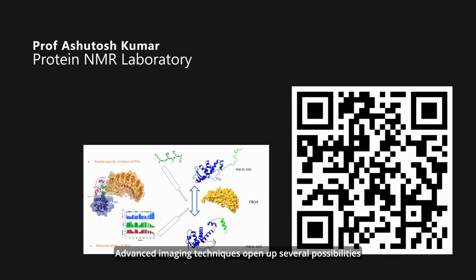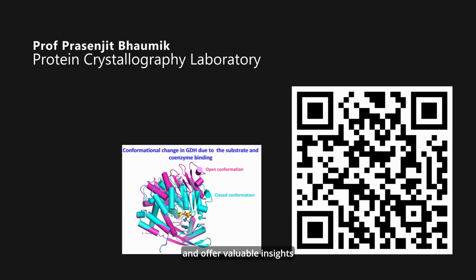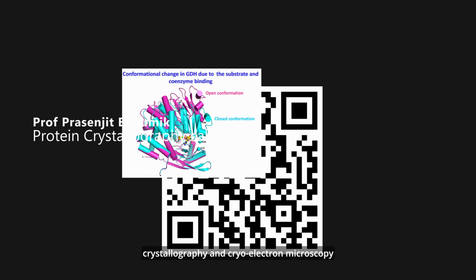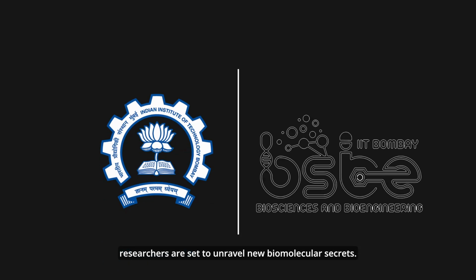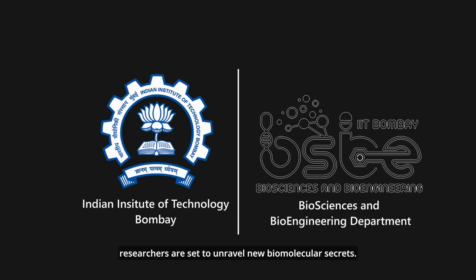Advanced imaging techniques open up several possibilities for studying structures of proteins and offer valuable insights into interactions between biomolecules. With the nuclear magnetic resonance imaging, crystallography, and cryo-electron microscopy facilities and expertise at IIT Bombay, researchers are set to unravel new biomolecular secrets.